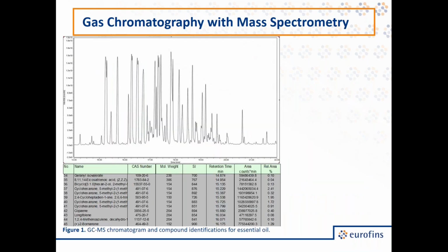So just to give you one more example of what this looks like, on the slide, I have the volatile profile of an essential oil. So a product that is known for having a very strong aromatic profile. As you can see, there are a lot of peaks and a lot of compounds present in this sample.